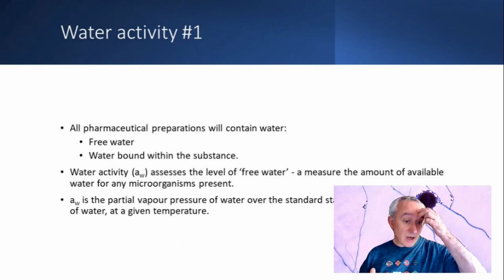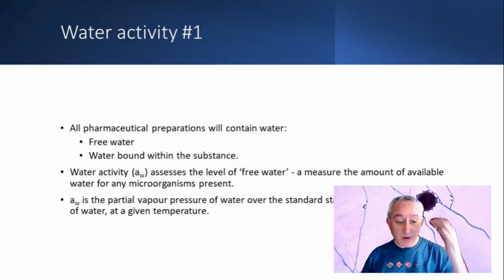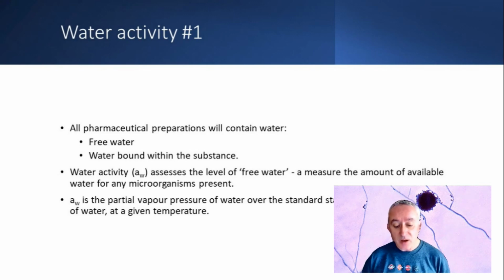We can also relate some of the organisms that we find to water activity, if we're using this as an expression in some non-sterile pharmaceutical products. All pharmaceutical preparations contain water, and some of this water is free water, which isn't bound to the substance, and this available water is something that microorganisms can utilise. Water activity assesses how much free water there is, and it gives a measure of how much free water individual microorganisms might need. So we can have an understanding of what might be a risk in terms of potential product contamination, the level of water activity in our products, and whether we have a degree of confidence that those organisms would or would not survive.